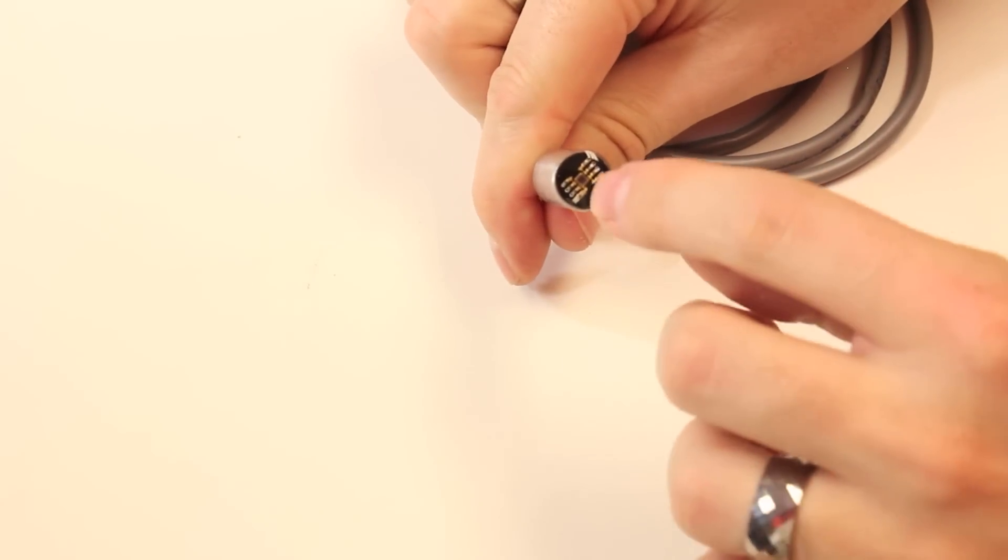Here is yet another product from Atlas Scientific. This is basically a color sensor, is it not? It's a lot similar to the color sensor breakouts that we have, except for you guys have spent the time to put the electronics into this and actually seal it up to give a very usable, easy-to-read output. At the end of this, it's probably going to be hard to see in the video, but we've got an actual color sensor at the end of it. It's completely sealed on the front and the back, and then at the end of this, we've just got a few wires coming out of it.